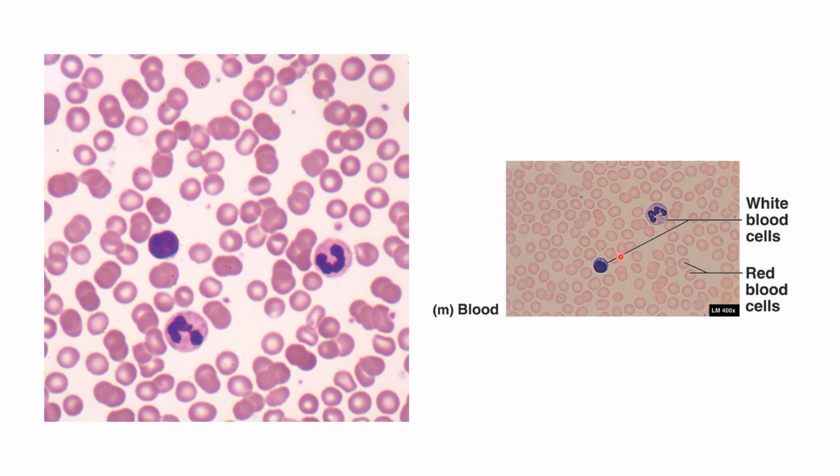Over on this other picture here, you can see a little bit more cytoplasm. The light blue is the cytoplasm, where that very dark color is the nucleus. So these are white blood cells, and they're called neutrophils. And this is a white blood cell type that's called a lymphocyte. So neutrophil and a lymphocyte.